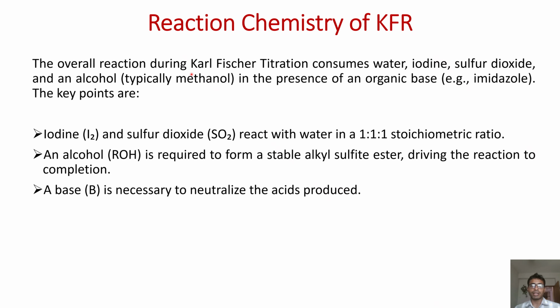The overall reaction during KFT consumes water, iodine, sulfur dioxide, and alcohol, typically methanol, in the presence of an organic base like imidazole. The key points are: iodine and sulfur dioxide react with water in a 1:1:1 stoichiometric ratio, and alcohol is required to form stable alkyl sulfite ester, driving the reaction to completion. A base is necessary to neutralize the acid produced.